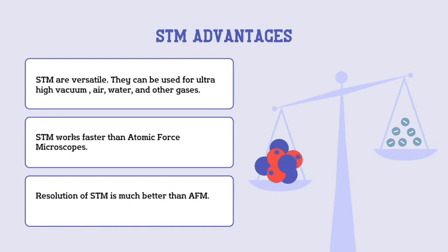STMs are versatile. They can be used in ultra-high vacuum, air, water, and other gases. STM works faster than atomic force microscopes. The resolution of STM is much better than atomic force microscope.